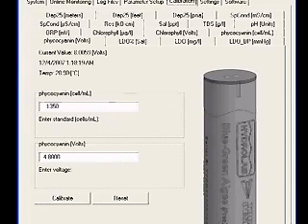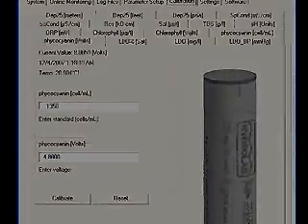These concentrations and voltages can be used for future calibrations of this specific blue-green algae sensor. The blue-green algae sensor is now calibrated.